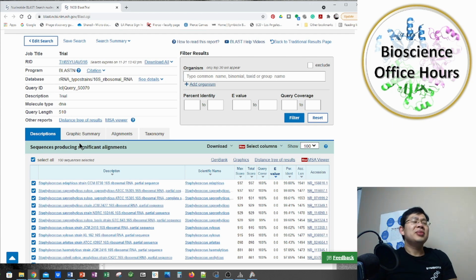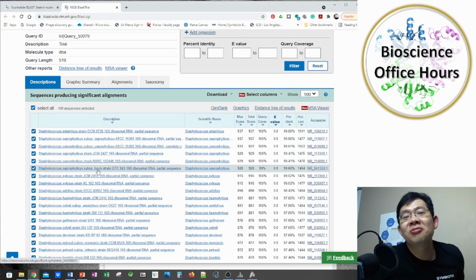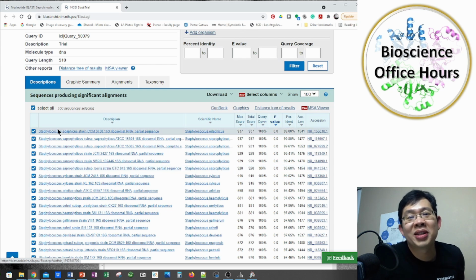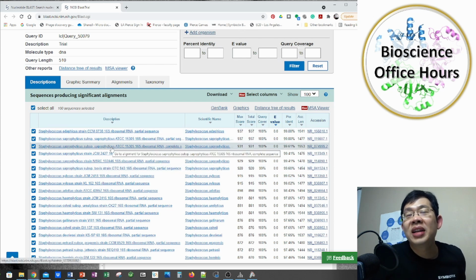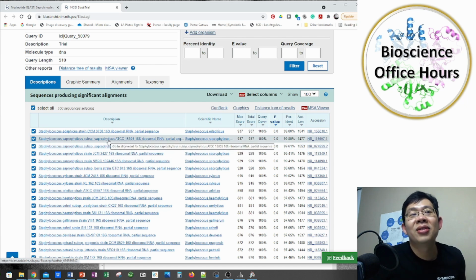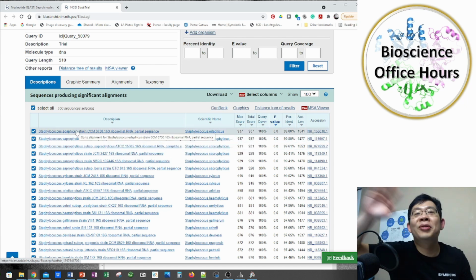Now, if you get something like this, how do you know? Well, I told you the top one usually is the correct one. So one way, if you don't really care about validating your result, is you just take the top one, and here, this is my unknown, and you're done.